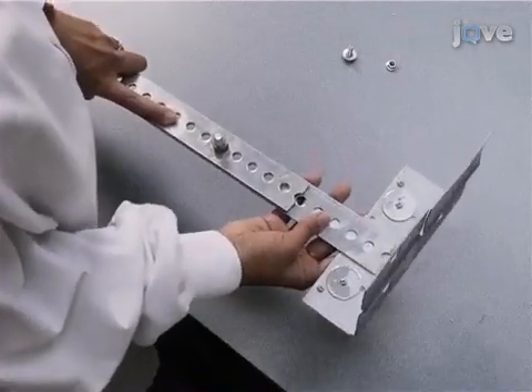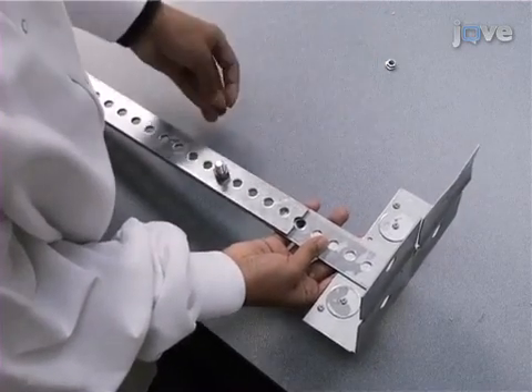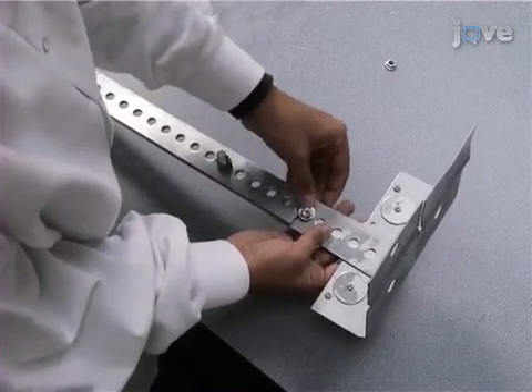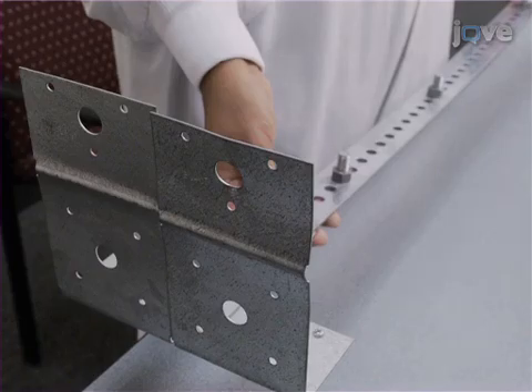Now, using a slotted plate, align the slots on the strong tie T-strap with the slots on one end of the slotted plate, then secure the two together with Helmand nuts and bolts. Drill holes for attachment if the slotted plate and strong ties do not have existing ones.